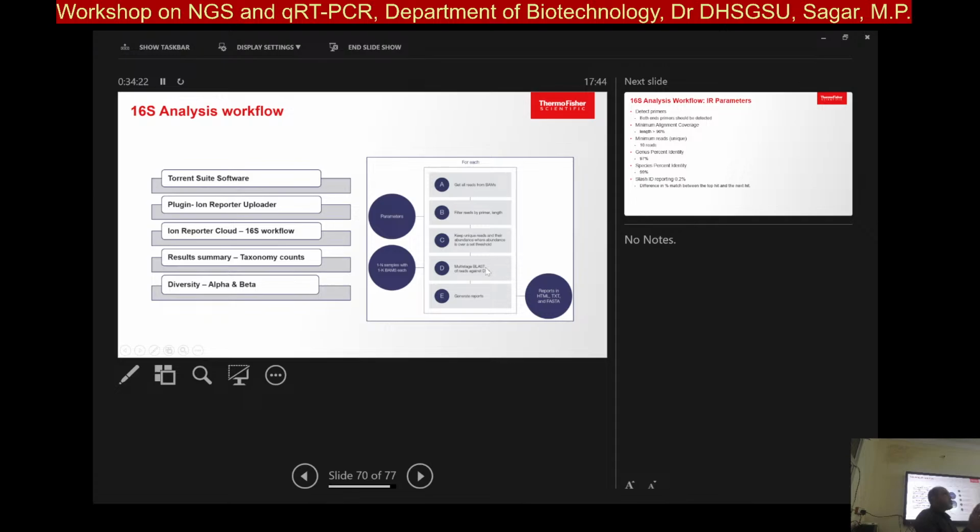But इस तरीके से diversity, where you are trying to see how diverse the sample is within itself. तो अगर हमने देख लिया कि स्पीशीज कैसे आ रहे हैं, काउंट्स कैसे आ रहे हैं, तो उसमें डाइवर्स कितना है एक दूसरे से. मैं अगर बोलूं कि 100 स्पीशीज मिल गए, राइट, चलो सैंपल में 100 स्पीशीज आ गए, बट प्रोपोर्शन में कैसे है? या एक ही जीनस के 10 स्पीशीज आ रहे हैं उसी के अंदर, and rest of them are coming as such. So हम प्रोपोर्शन में देखना चाहेंगे, राइट, कि कौन से जीनस का सबसे ज्यादा आ रहा है.